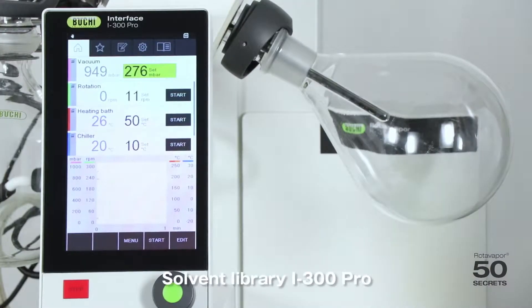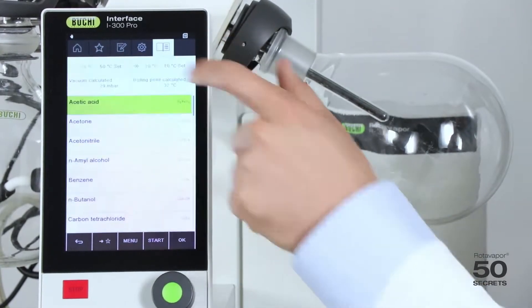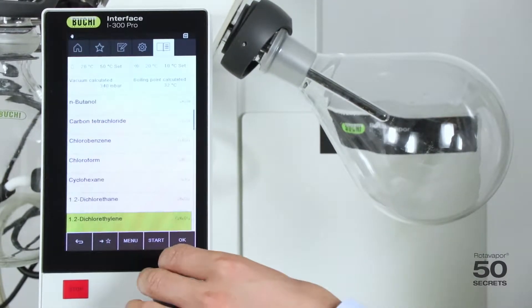First I would like to show you the solvent library of the i300 Pro. We can find it under this library icon and then Solvent Library. And there is a complete list of a lot of different solvents.